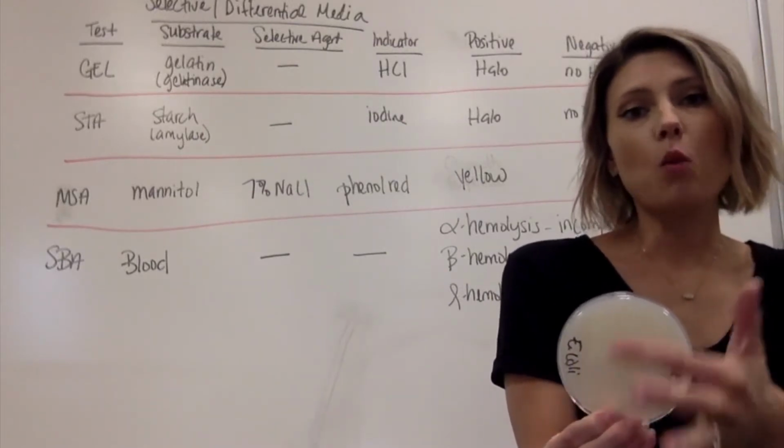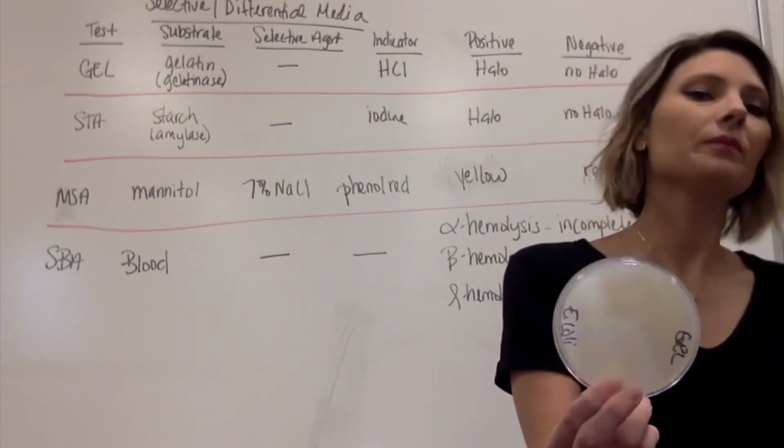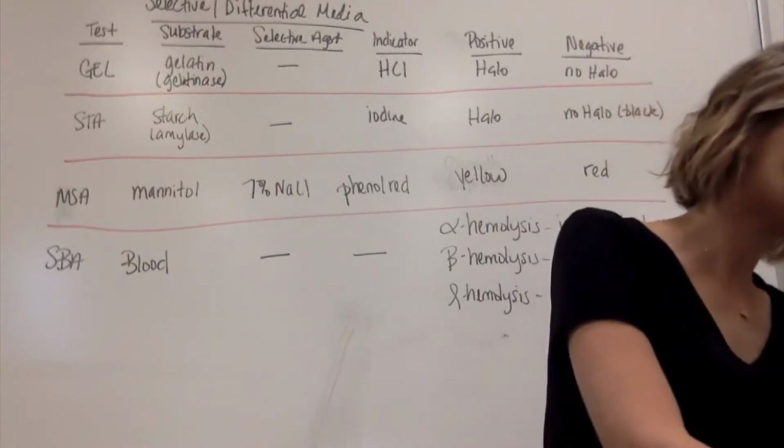And they're very white, and that white color that you're seeing is the gelatin on the inside of the plate. Okay, so that's why they're that very white color.